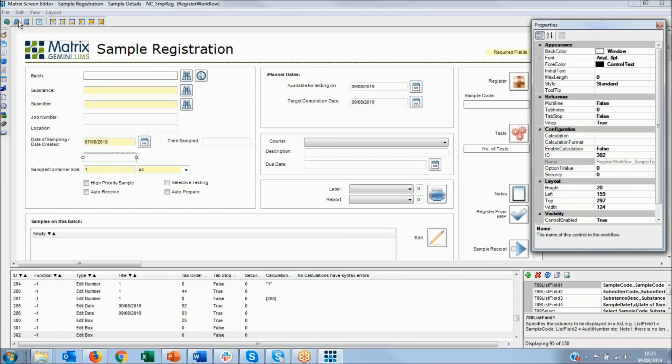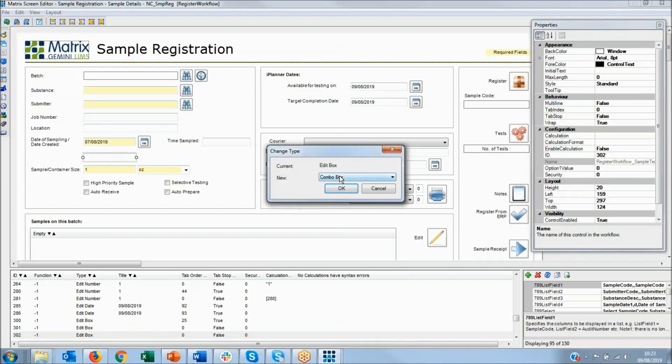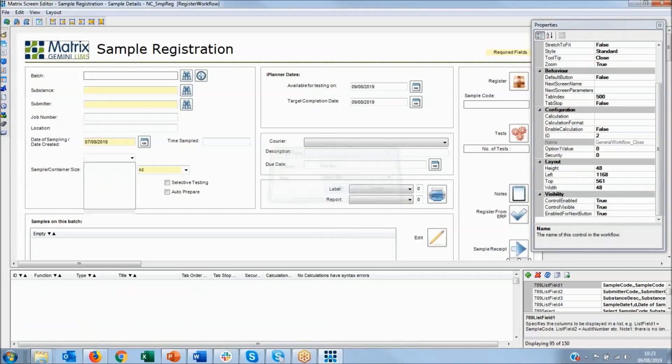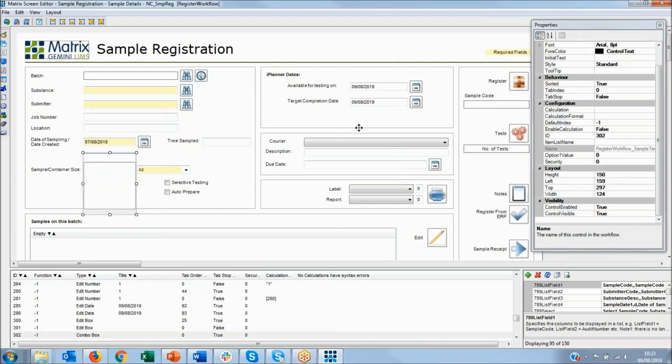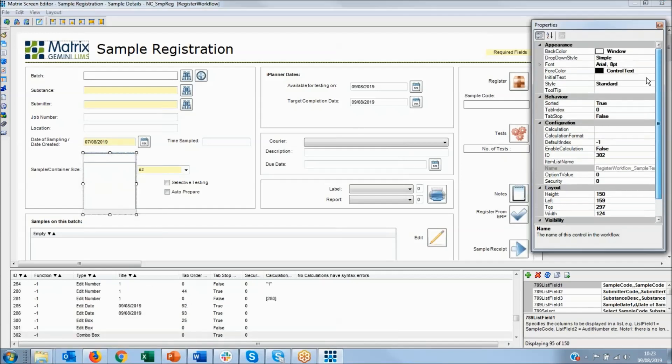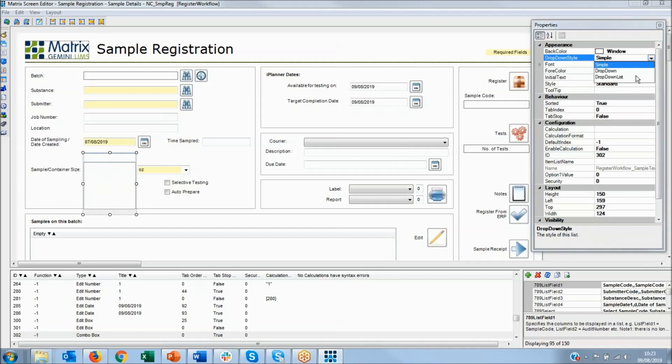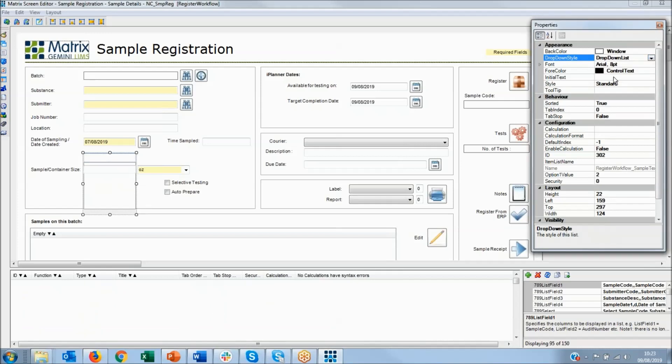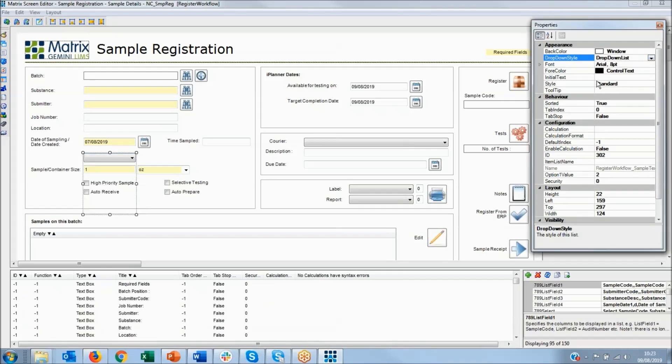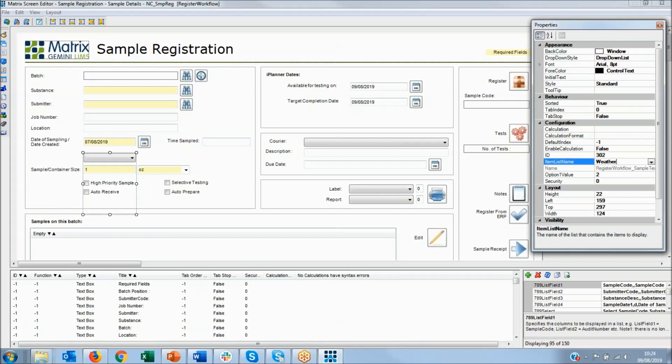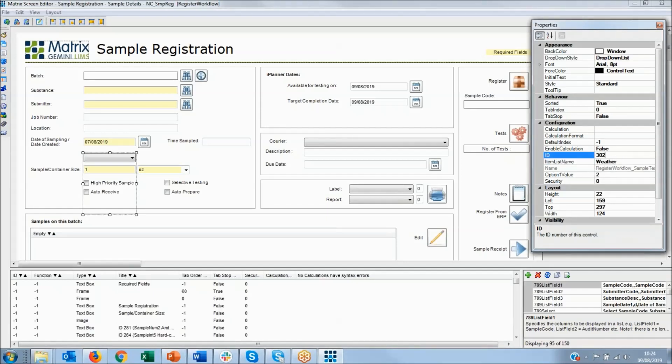I'm going to change that to be a combo list box. And instead of being a simple combo list box, I'm going to call it a drop-down list. So we'll have a list of things in here which we can call. And actually, I've already predefined a list called weather with sunny, rainy, etc. in it. So we'll just use that.